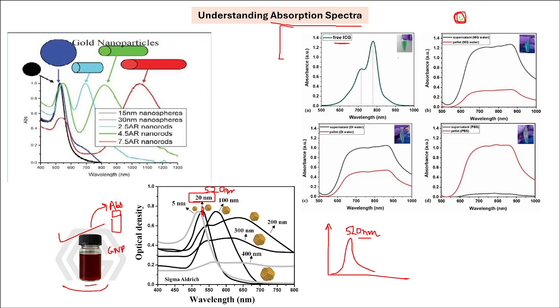So if we want to see, okay, this is the free compound, and when we are loading it in a nanoparticle, there's also a slight change in the color and also spectral broadening that we are observing. So based on these features, we can also preliminarily say that, okay, my nanoparticles are kind of formed.